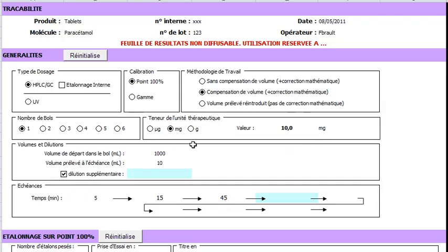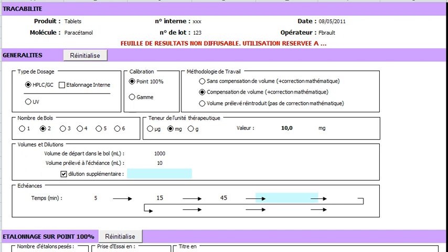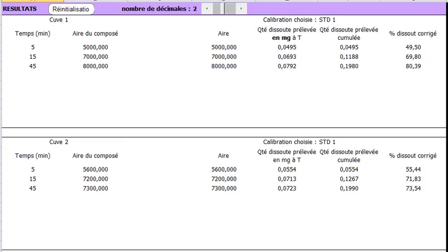Now we add a second vessel. Of course, it should be decided at the beginning, like this. The vessel 2 has appeared in the form. We already entered the responses.